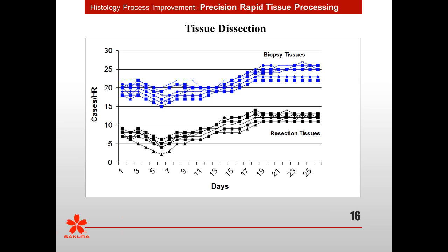Think of a colon. The process of opening up the colon, rinsing the colon, maybe you pin and fix the colon, then you come back to that colon. Think of all the time that's used there.